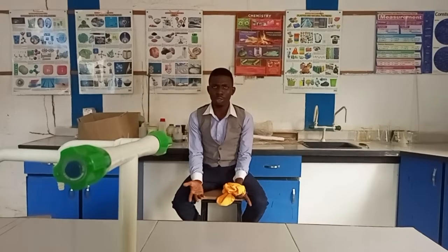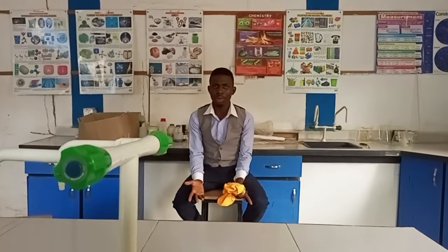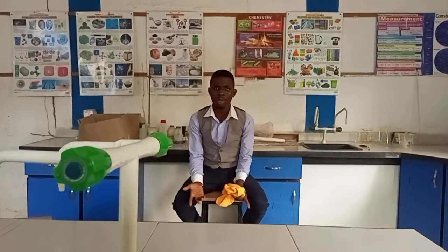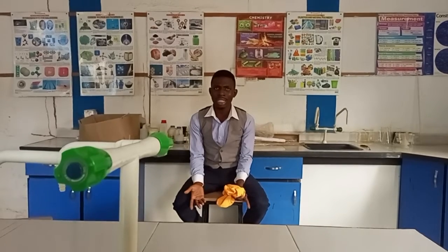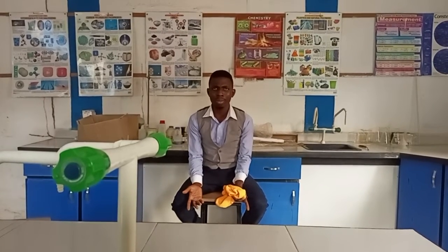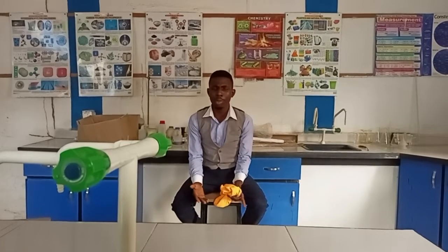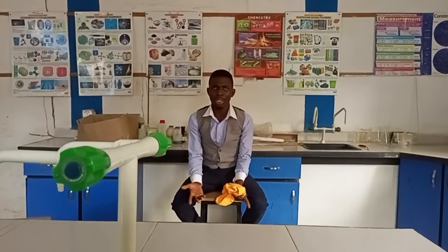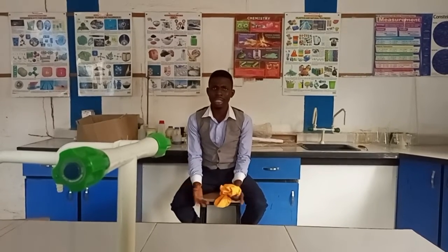Those are some of the precautions you put in place when performing your titration experiment. You can also tell them that when you are measuring your acid, you ensure that the funnel was removed before performing your titration experiment. The next one again, you avoid air bubbles when making use of your pipette.